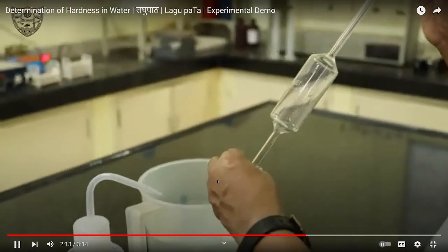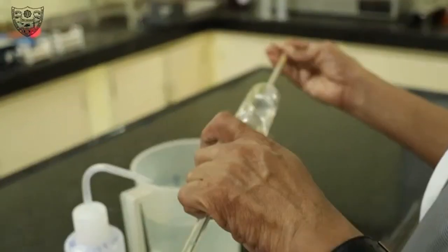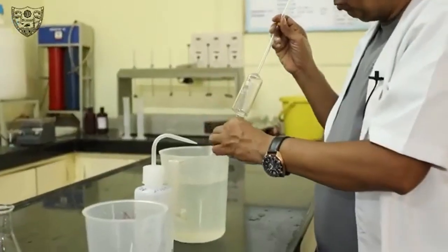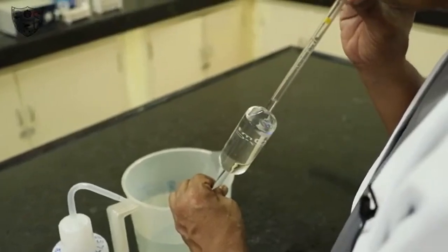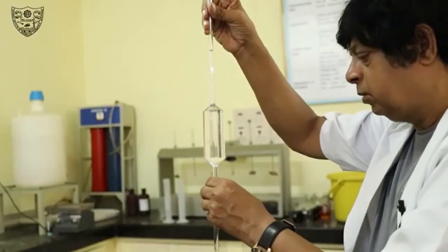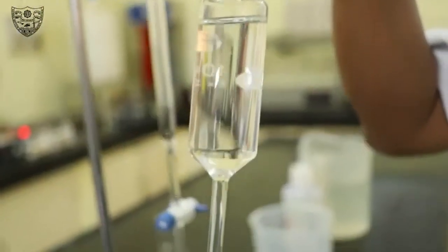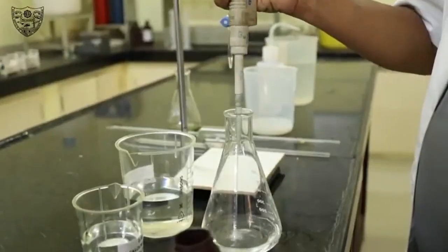Sample analysis. Rinse the 100 ml volumetric pipette with sample. Pipette out 100 ml into a 500 ml conical flask. Add 1 ml ammonia buffer solution.